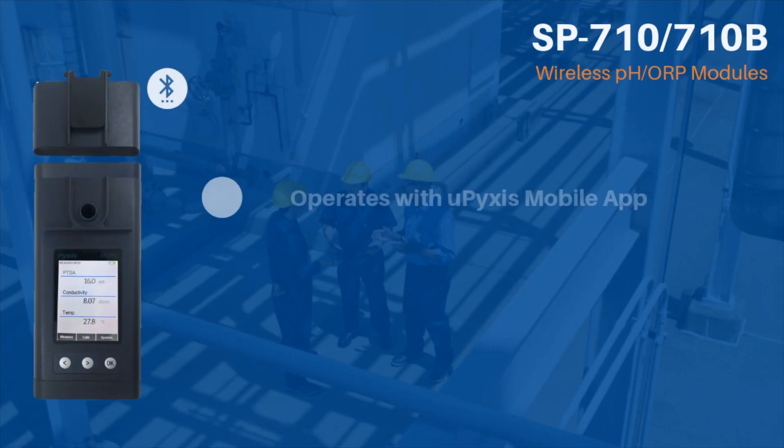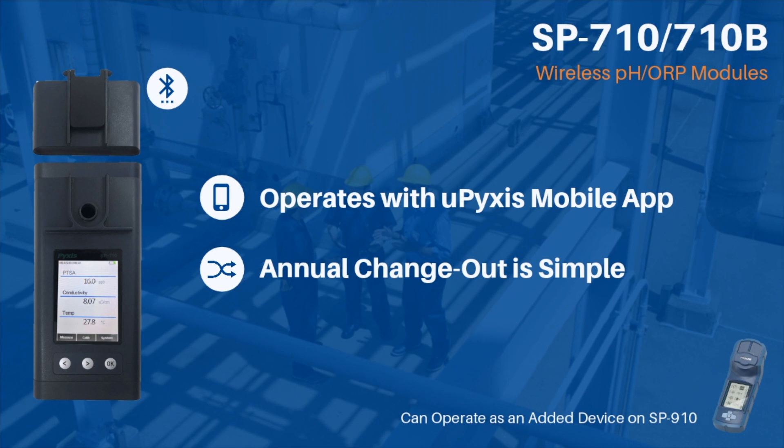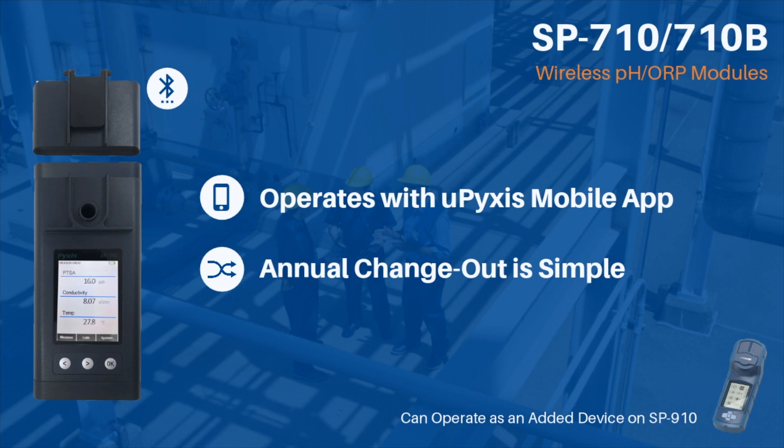The pH/ORP module may also be used independently and viewed by the UPIXIS app for smartphone, or as an added device to your SP910 multi-parameter color meter. Annual pH/ORP module change-out is as simple as pairing your smartphone to your car, allowing you to get back to testing in no time.